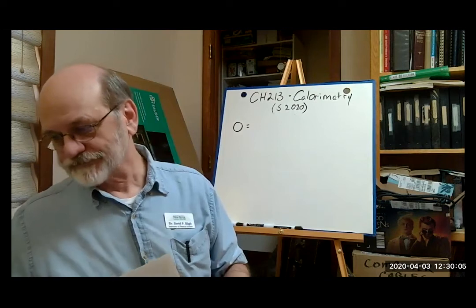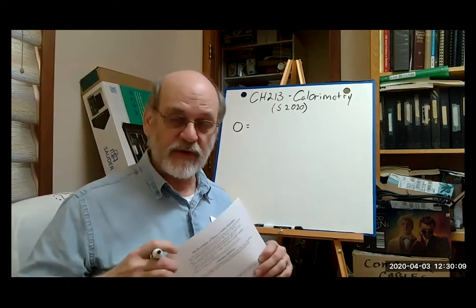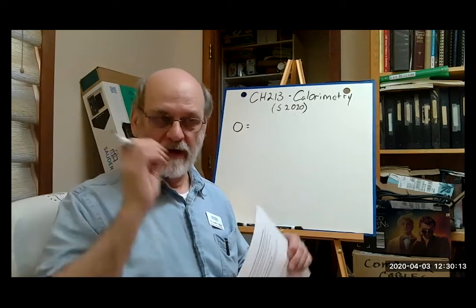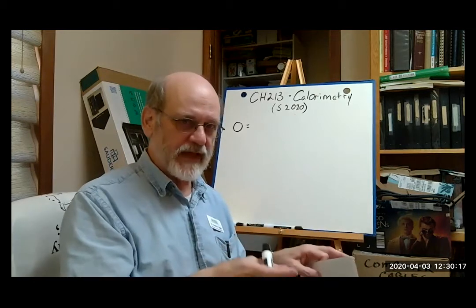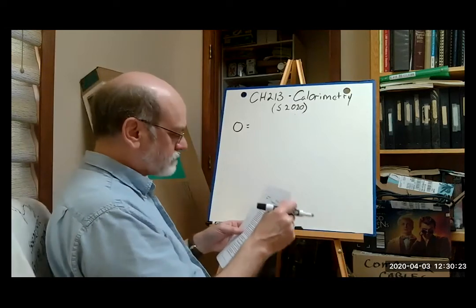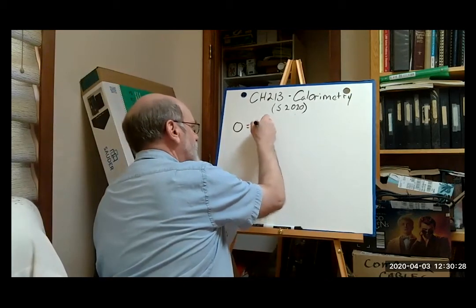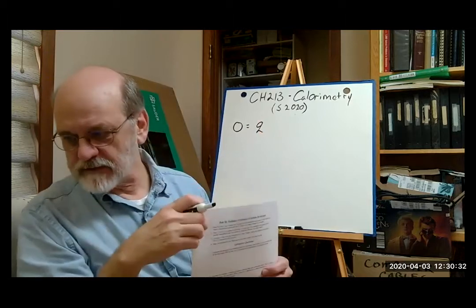Fortunately for you, the class last spring that collected this data were able to determine that the temperature of the base and the acid, before we mixed them together, was exactly the same. So they started out at the same temperature. That means we're looking for this one, the heat of neutralization.